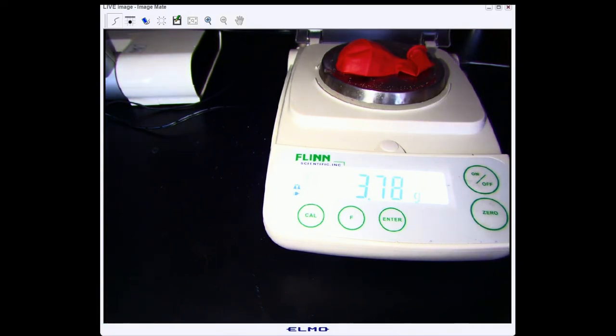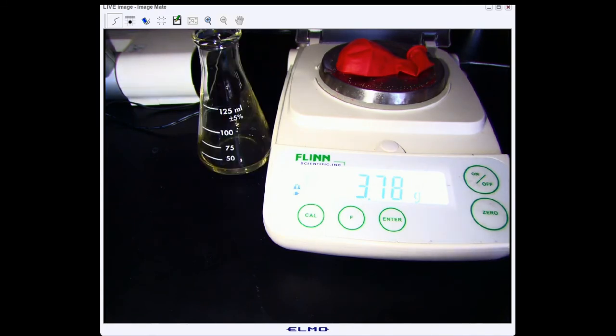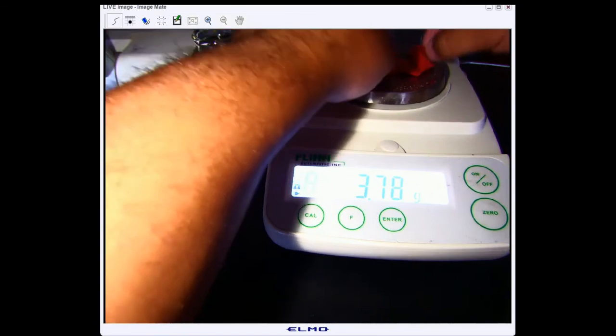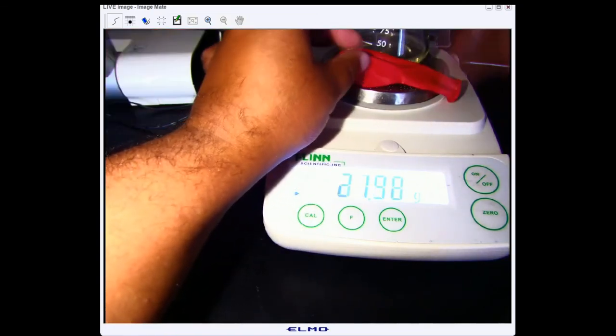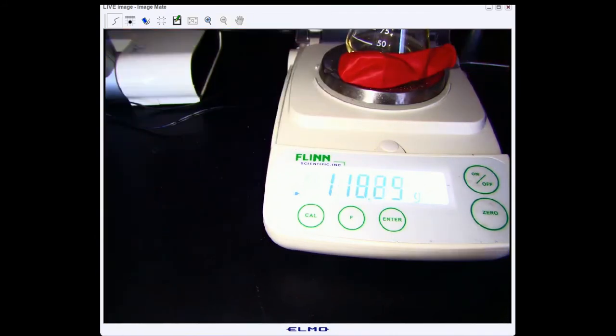Now we need to get ready to run the reaction. All right, so we have our vinegar again. Just to make sure, we're going to take the mass of our reactants and their containers carefully here. And we'll record that. And now we're good to go.